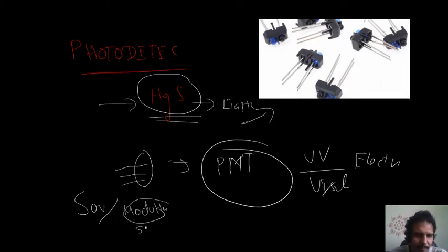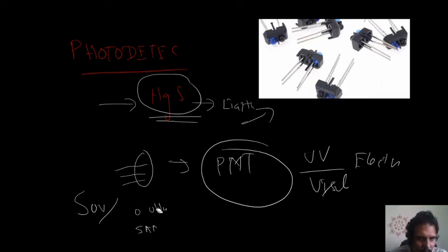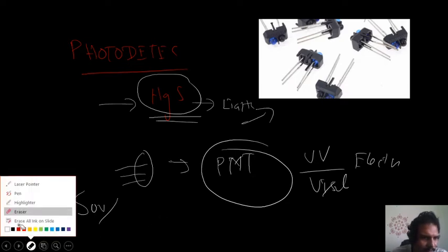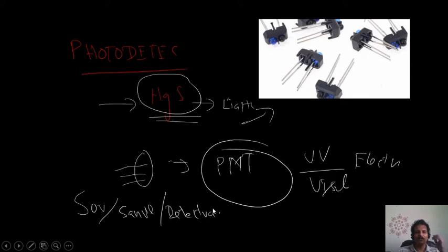What I meant is sample handling, not modulators. Then we have seen detectors. Now we'll see the complete block diagram.